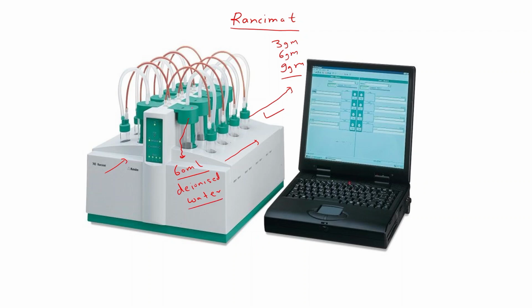Then here we have the silicone tubing. You can see that these are the silicone tubes. Since we are providing accelerated conditions, the volatile acids, the secondary oxidation products, will move from this silicone tube to the water. And this is the conductivity electrode. Here we can see that 8 samples can be analyzed simultaneously: 1 2 3 4 and 4 here, so a total of 8 samples.